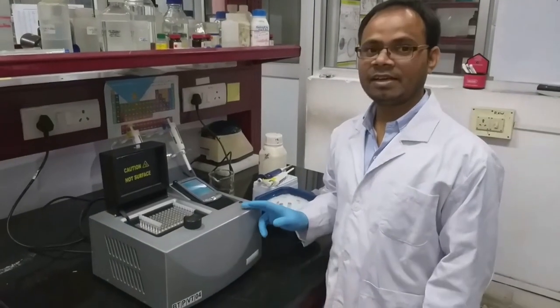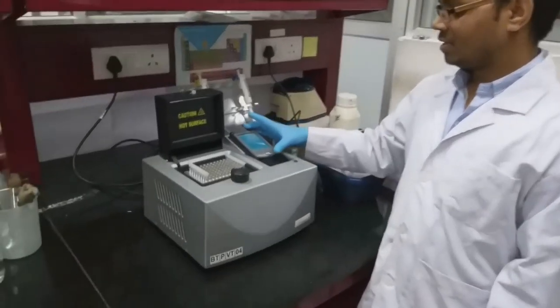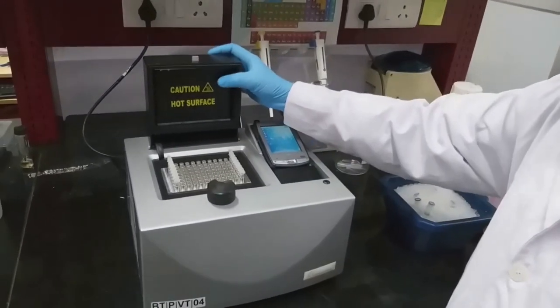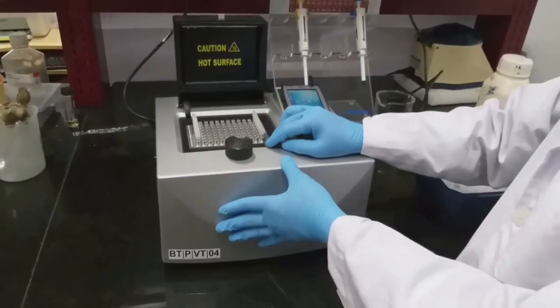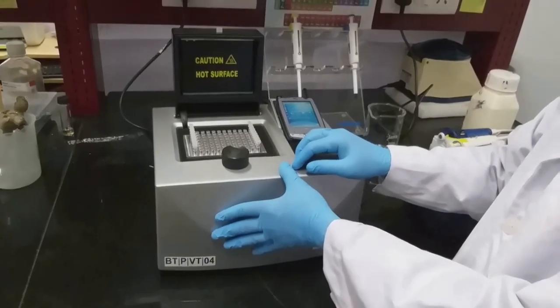This is an earlier version of a thermal cycler which contains a display unit where we can observe the parameters and change them. This is a hard shield, this is the sample holder, and inside there is a Peltier system which can maintain the temperature fluctuations.